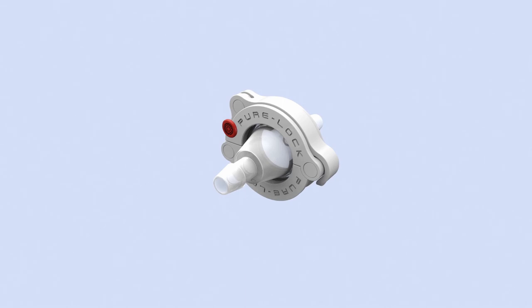Suitable for single use or repeat applications and meets USP class 6 and FDA requirements.